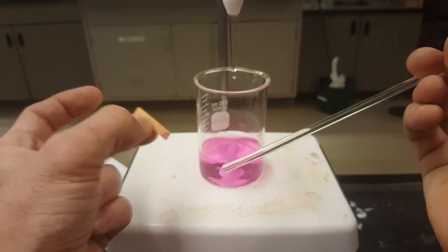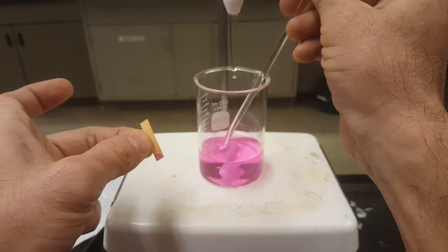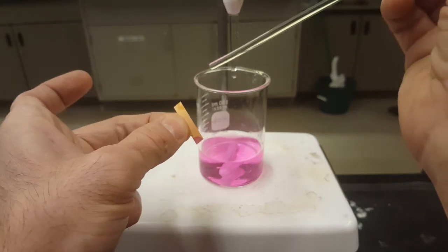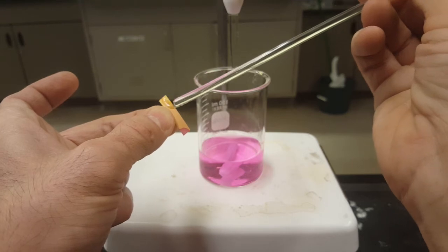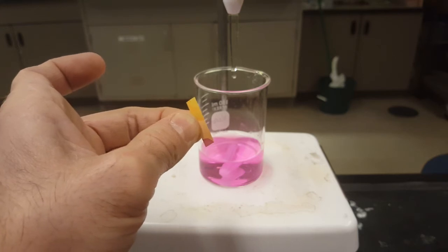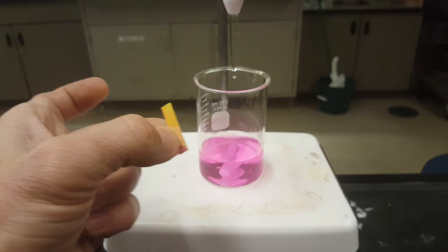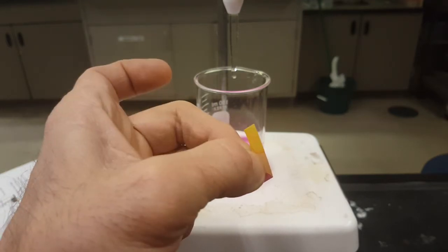Wash your stir rod off, grab that piece of pH paper again. Interesting. Let's go compare that to the color chart.